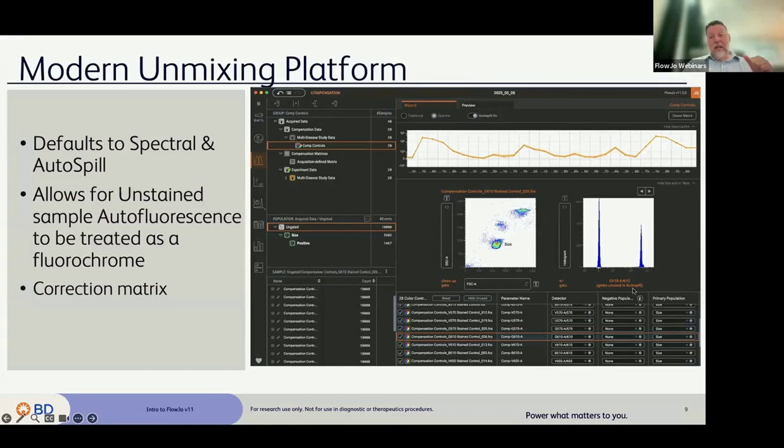New in V10 11.1, right? The one that just came out. We actually have T buttons here, and I didn't update the slide today, but there is a drawer that allows you to transform here in this window, in this context, through the transform slider bar, that drawer that comes out. And you don't have to leave this context to change the transforms in order to get your positives and such. But it is pretty slick, and I highly recommend that next webinar for details on it.